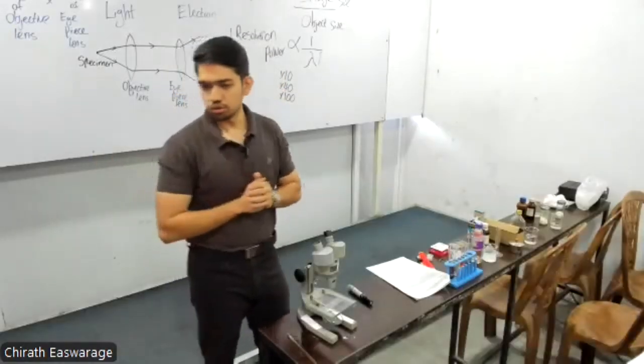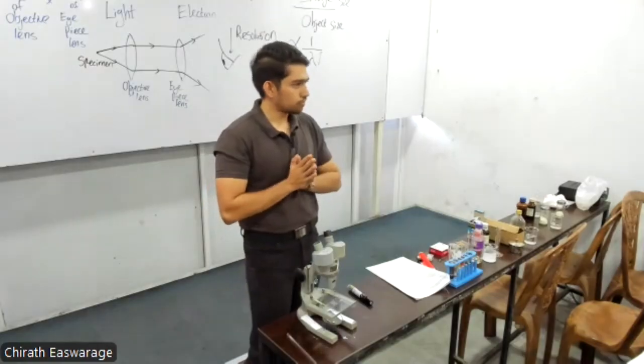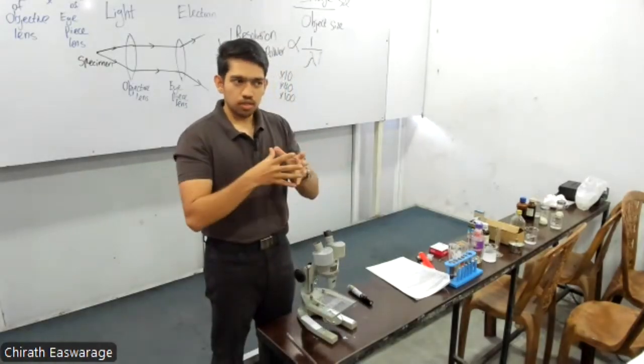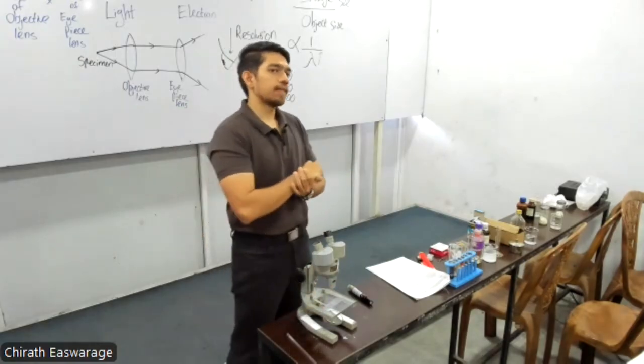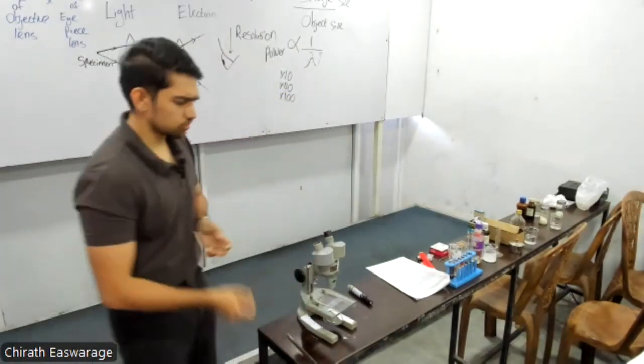I'll show you a proper microscope using the projector. We are going to label it. So there's a diaphragm as well, right? The diaphragm is to increase the aperture, the size of the light beam that is hitting the specimen. Then after the diaphragm, we have what?